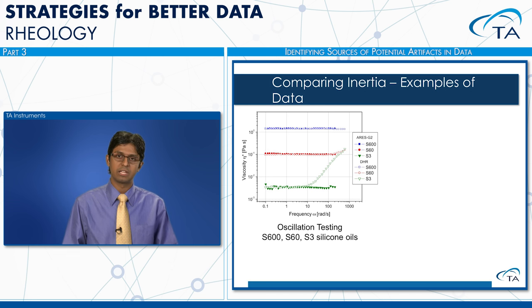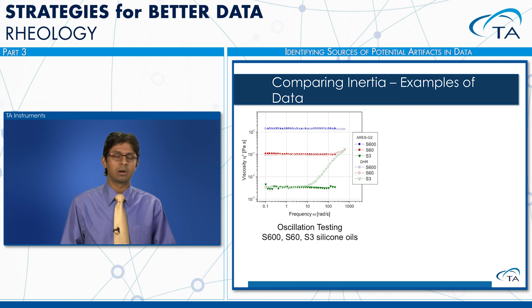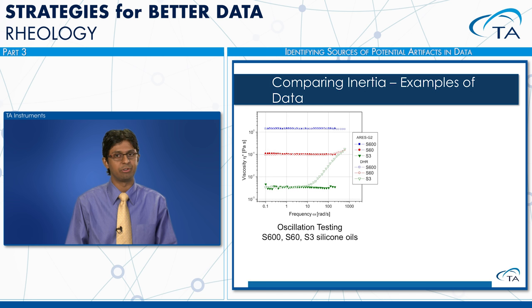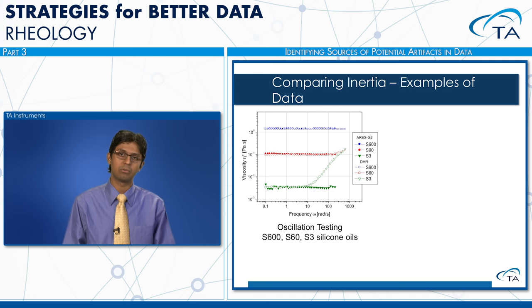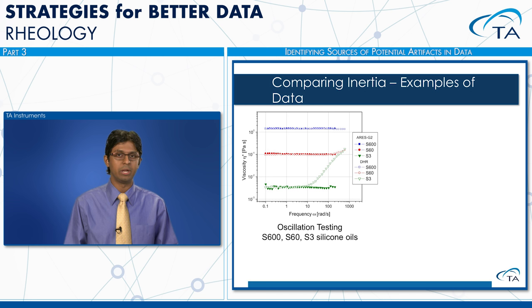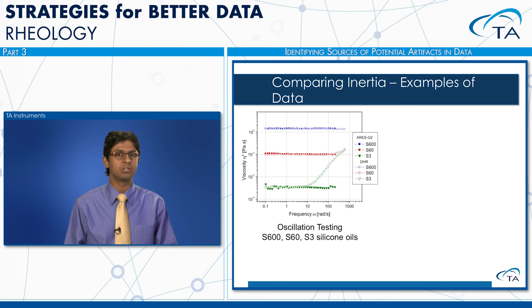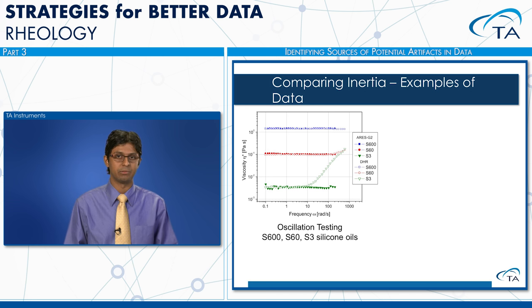Here are examples of inertial effects when dealing with low viscosity samples — frequency sweeps on three silicone oils: S600 (highest viscosity), S60 (medium), and S3 (low viscosity), on the dual head ARES G2 and single head DHR platforms. For S600, both instruments agree across all frequencies. For S60, there is slight uptick in complex viscosity at highest frequencies. For S3, data above about 10 radians per second shoots up significantly — a result of inertial effects.